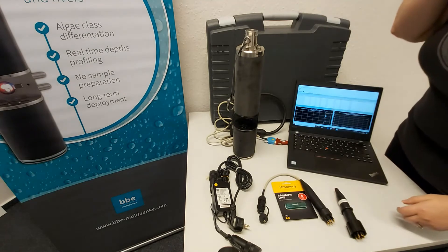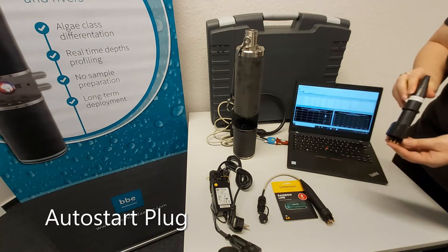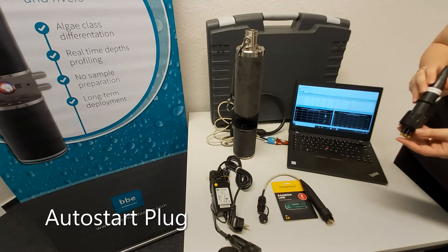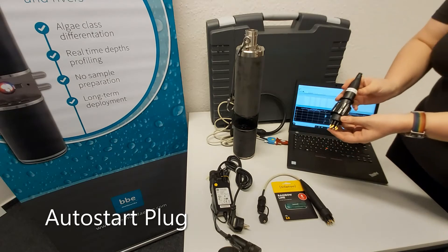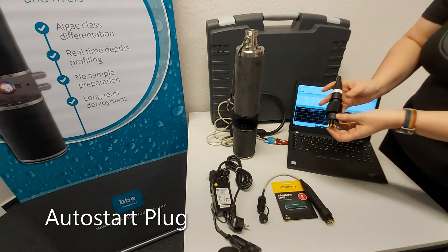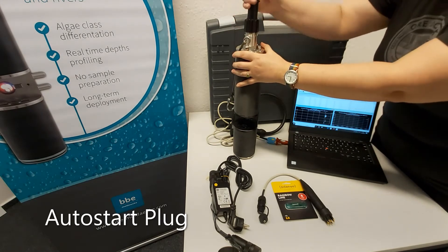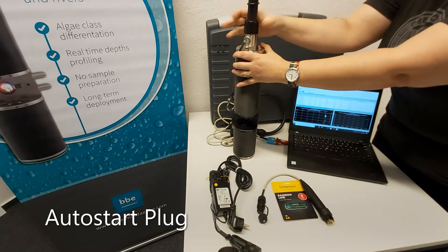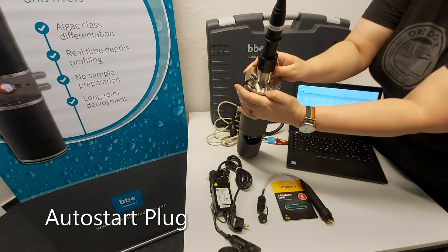Next, I wanted to show you the auto-start plug. This is used to make measurements in the field without the use of a computer or other controlling device. It's super easy to use — all you have to do is plug it in on top here, and as soon as you plug it in, it starts taking measurements. We can now see the LED is telling us that it's measuring.